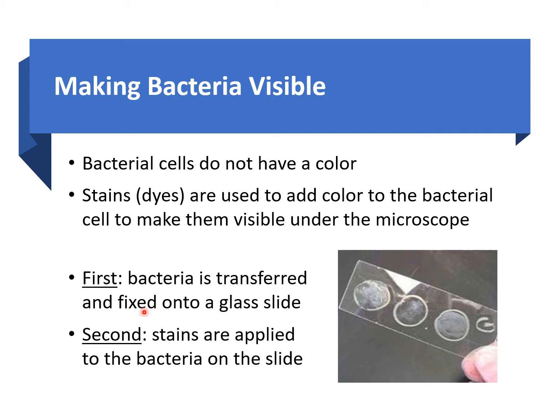We're also going to talk about how to fix bacteria onto a glass slide. We're going to talk about how we do that by passing your slide a couple of times over a flame. So we're going to talk about that in more detail in just a few.